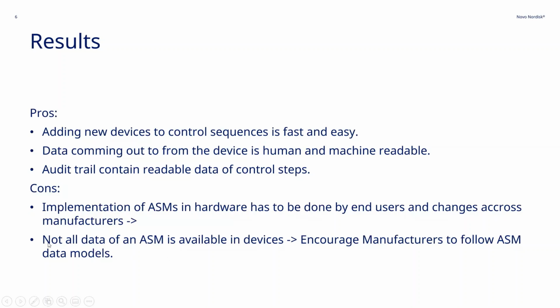And the second one is that when we were implementing it ourselves, of course, all the devices are different, and some manufacturers decide to expose some of the data, some decide not to expose some of the data. And when the data is not there, we cannot extract it and we cannot use it to completely fill the ASM. But yeah, that's the way it is. I guess we would like to encourage manufacturers to follow models like that.